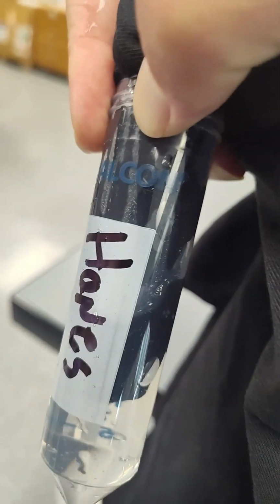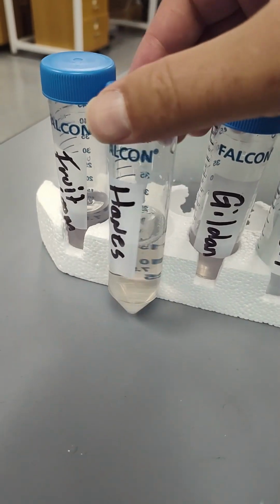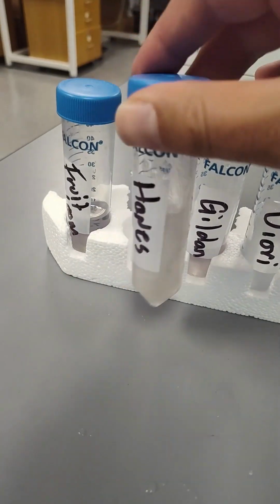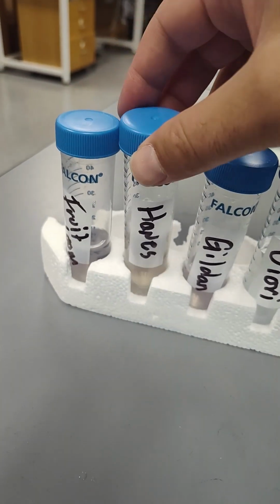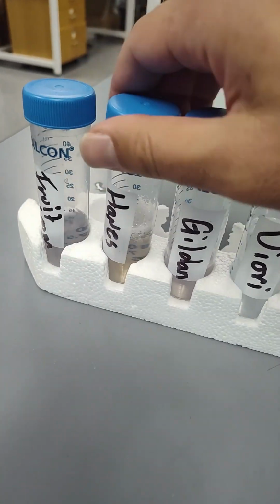Cool. Alright, we got the Hanes. The Hanes is weird. It absorbs water differently. It's almost like hydrophobic. And it's the only shirt that has a tag. So, anyways, Hanes is in the tube. Hanes again has a little bit of a dark color compared to the controls, a different color than the Fruit of the Loom and the Gildan. It also has way more foam, I'm assuming some sort of detergent or something. And again, you can see it's got a little bit more liquid. Same approach, slightly more hydrophobic.